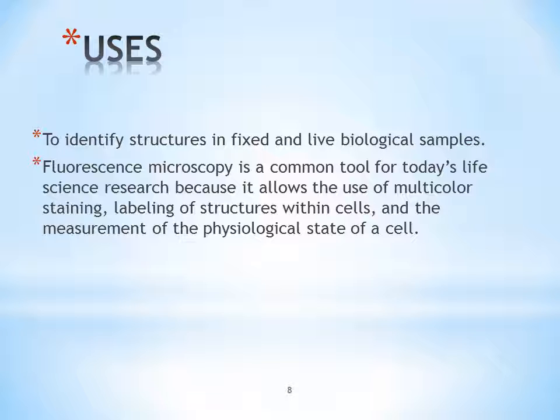Uses of fluorescent microscope. To identify structures in fixed and live biological samples. Fluorescent microscopy is a common tool for today's life science research because it allows the use of multicolor staining, labeling of structures within the cell, and measurement of the physiological state of cells.